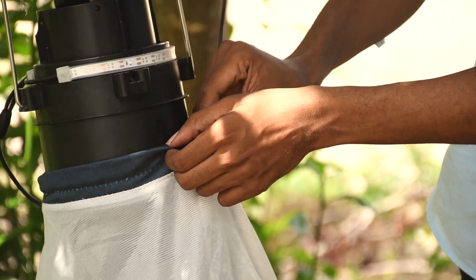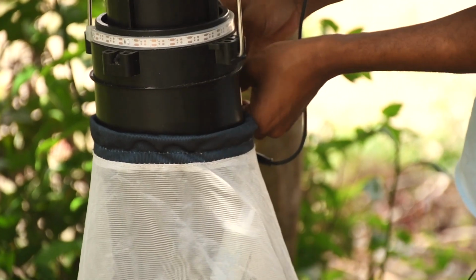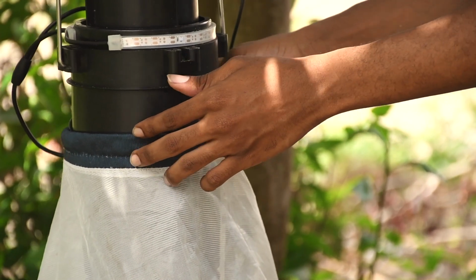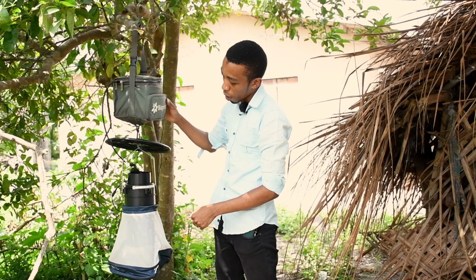So once we place it inside and the trap itself is running, the trap is now fully operational, and any Aedes mosquitoes in the vicinity will be attracted by two things: the mosquito attractant and the carbon dioxide that is running through the trap door.